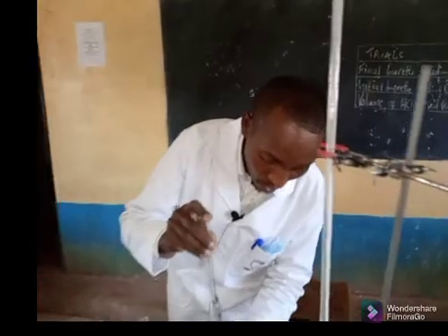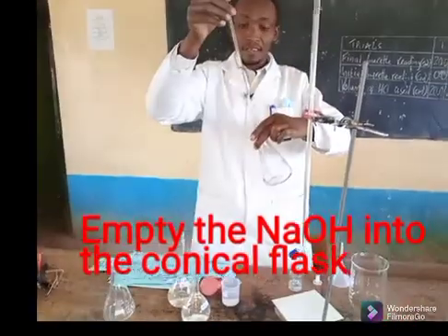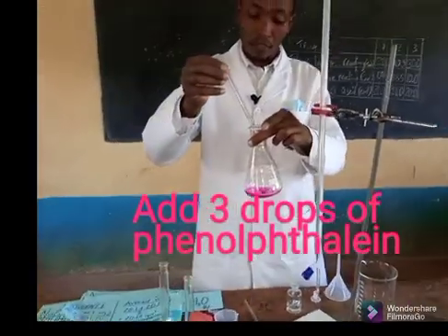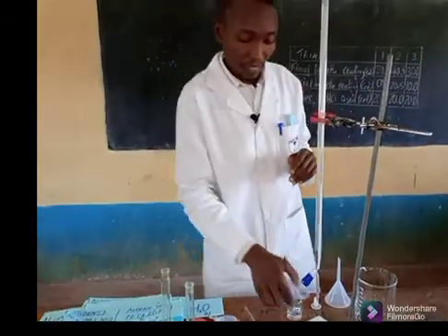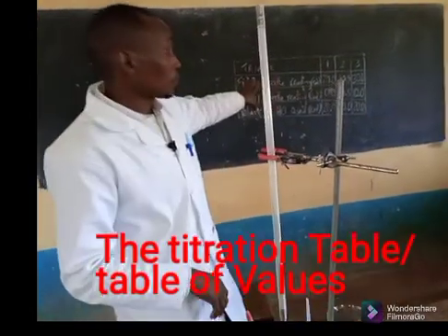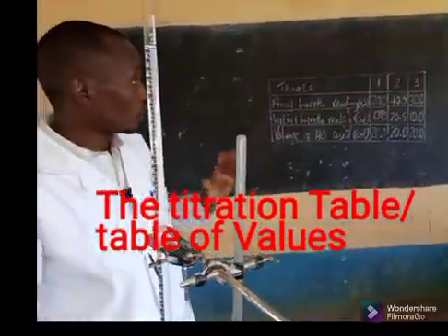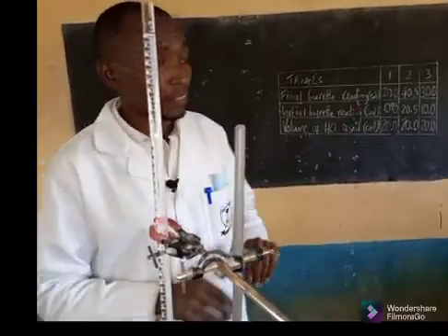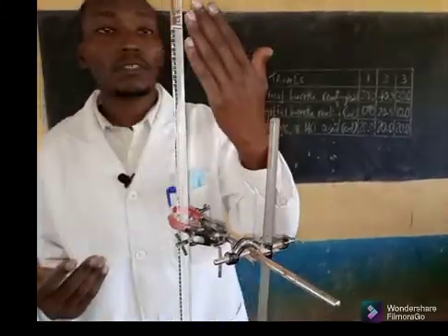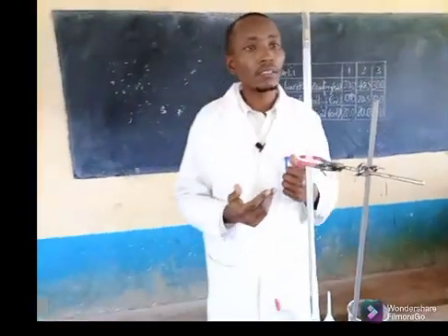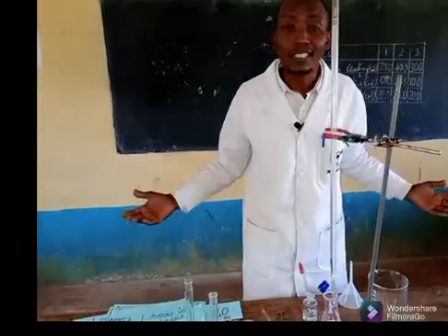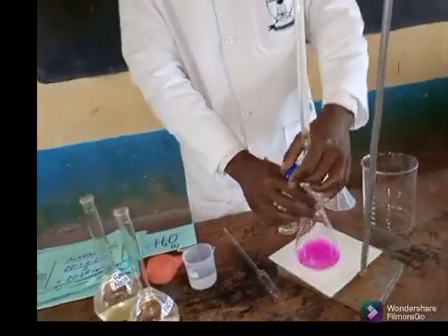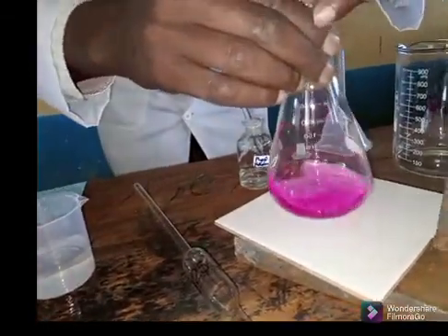I will empty the sodium hydroxide into a conical flask, then add three drops of phenolphthalein. It is picking up colour. Now I'm ready to start. Looking behind me, we have what you call the titration table. I have pre-done the trials but we can do one run and then go back to those figures. I have the hydrochloric acid in the burette and I'm ready to do a titration process. I will use my left hand for the tap and the right hand for the conical flask.